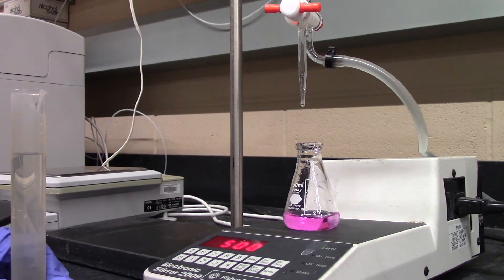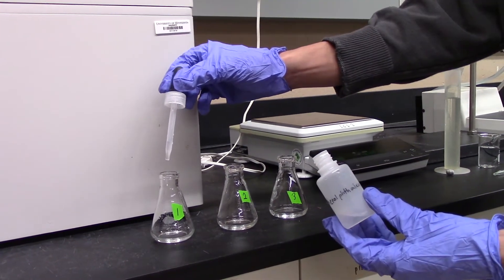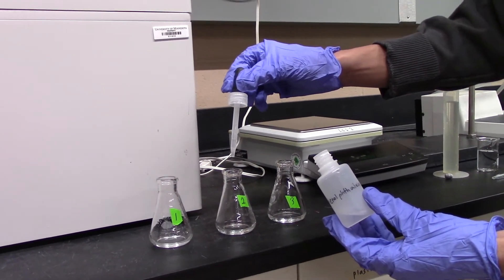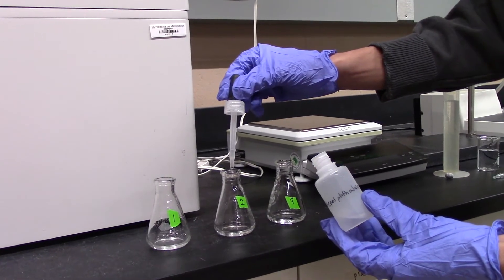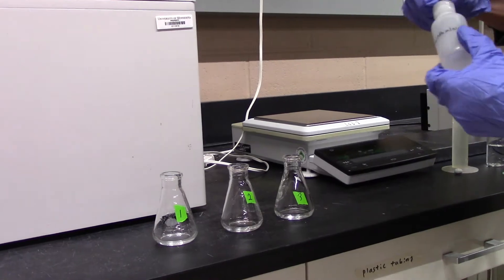This same standardization process should also be conducted for HCl. Furthermore, set aside several Erlenmeyer flasks, each containing 5ml of HCl and a drop of phenolphthalein, as these will later on be used for the quenching process.